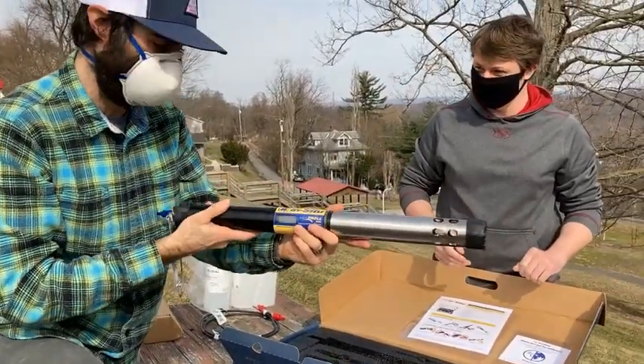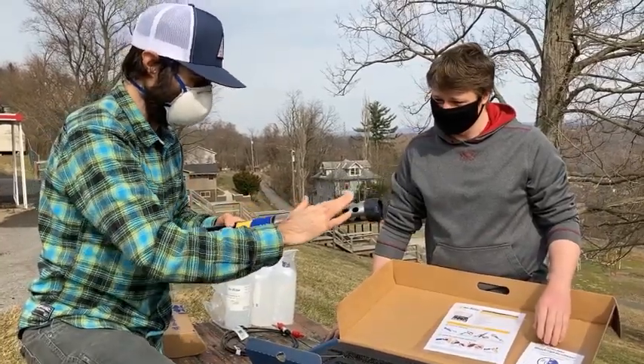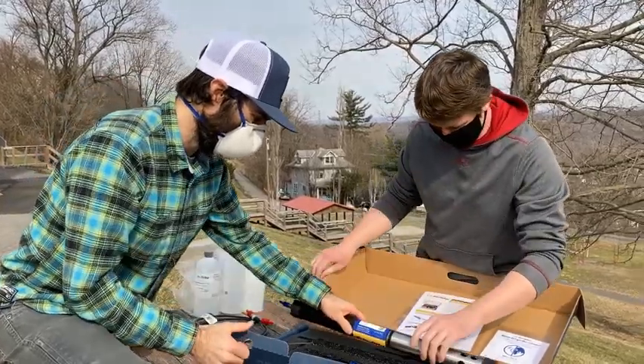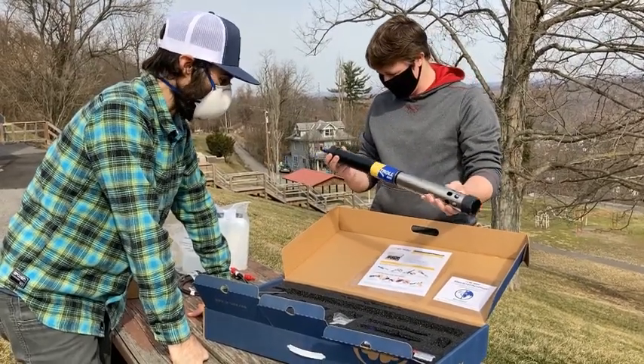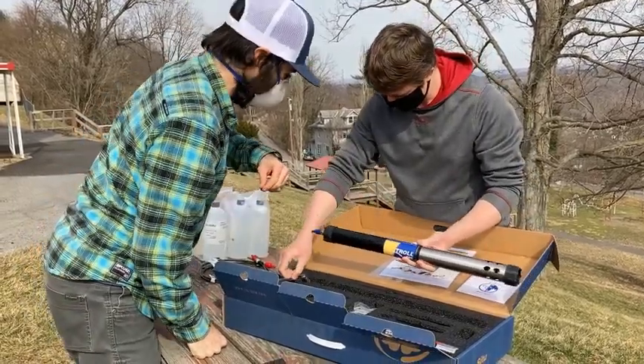All right, now we've got the big kahuna — we have an Aqua Troll 600! I hope you can hear me whistle — this is a fine piece of machinery. Man, that is nice. So clean, wow, that is so clean. I'm dying to get this thing in the water.